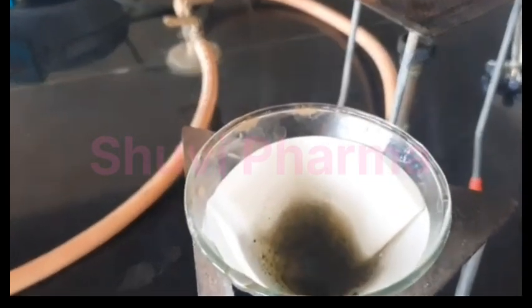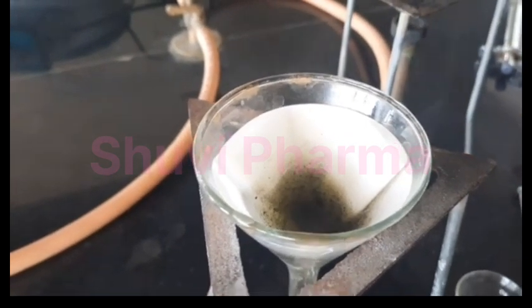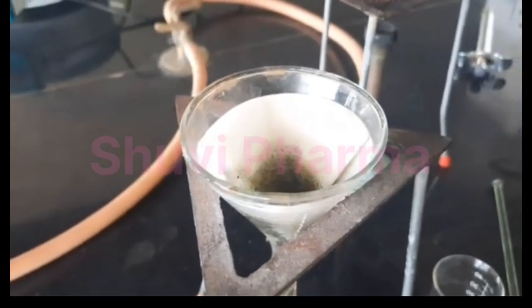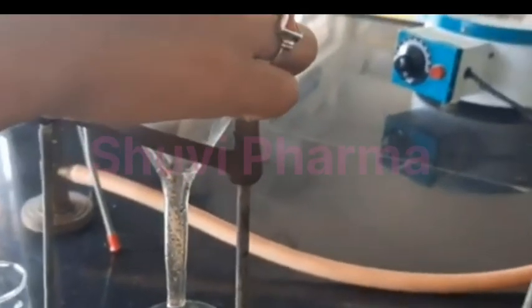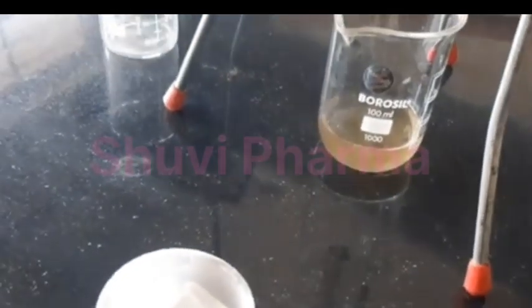So after filtration, we will place this filter paper into the crucible which is previously weighed, and then we will incinerate for 6 hours at 450 degrees Celsius in muffle furnace. Okay, so this is water soluble. This is acid insoluble.